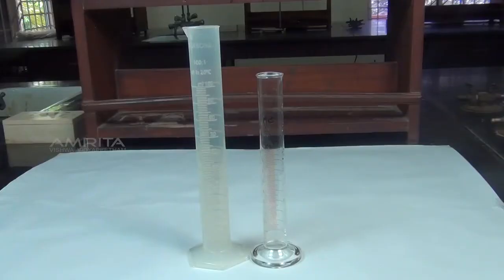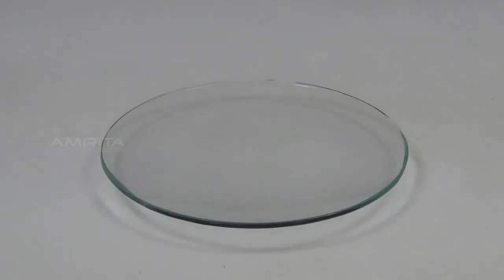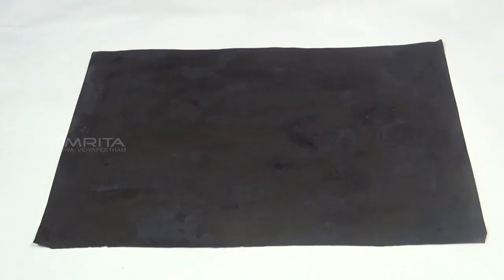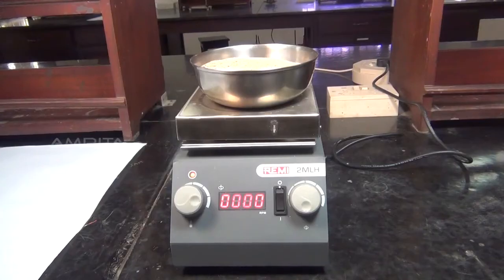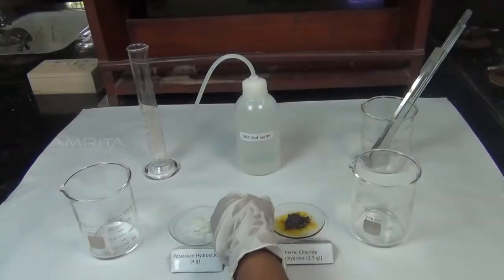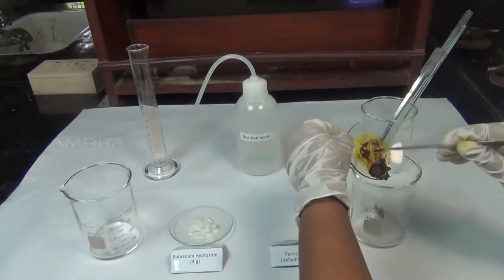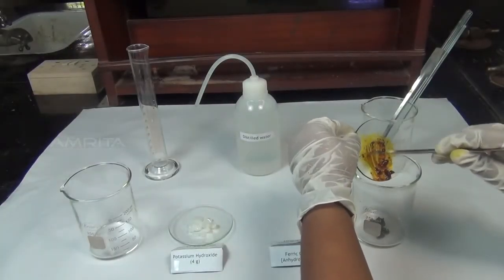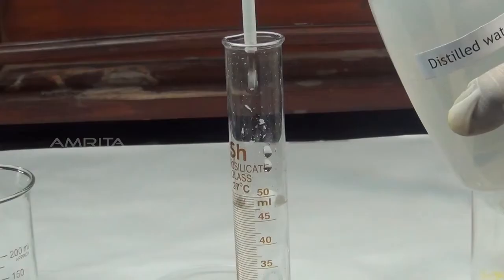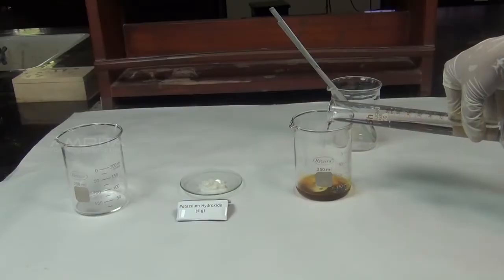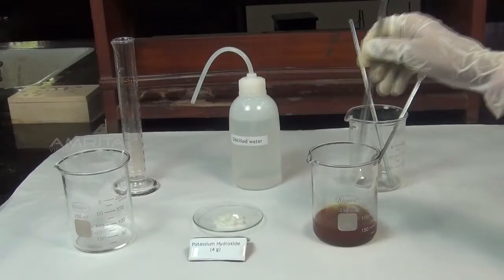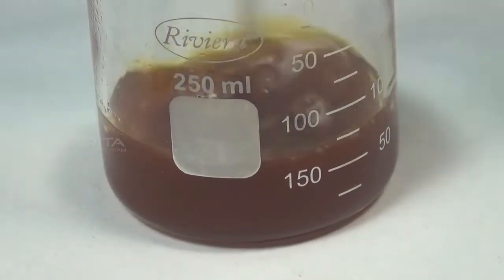Procedure: Take about 3.5 g anhydrous ferric chloride in a 250 ml beaker. To this add about 50 ml of distilled water using a measuring jar. Stir the solution using a glass rod to dissolve ferric chloride.